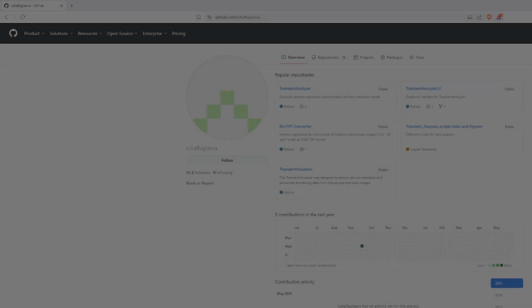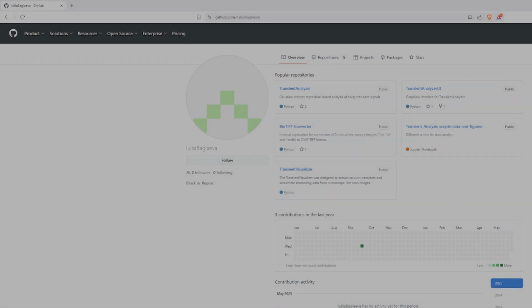Hi everybody, welcome to the TransientVisualizer video, and today I would like to explain to you how to work with the TransientVisualizer tool.